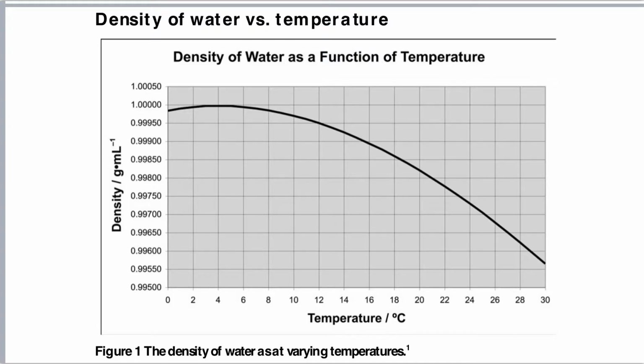So this is what the lookup table looks like. So the density actually changes with temperature. So you're going to have to actually measure the temperature. If the water temperature is about 23 degrees C, so 23 degrees C would be right about here. So you're going to kind of walk up and you're going to find this line. It's going to go right over here. So it is, oops, kind of a little bit squirrely there, isn't it? So that would be 0.997, and let's say it's slightly above there, 55 grams per milliliter.